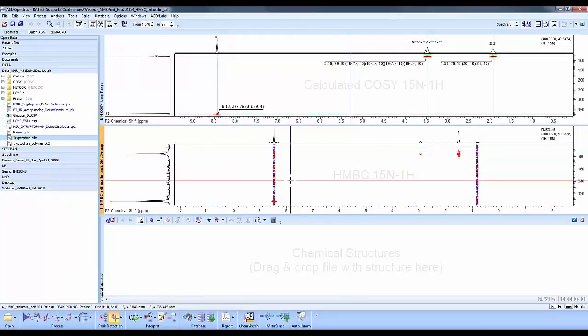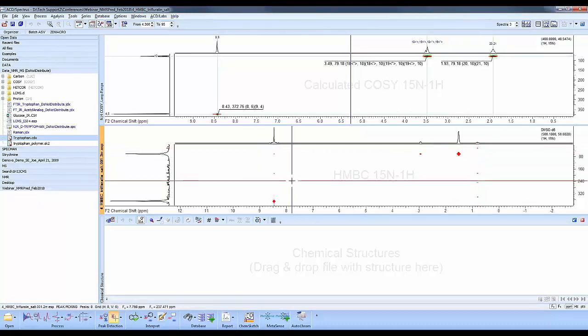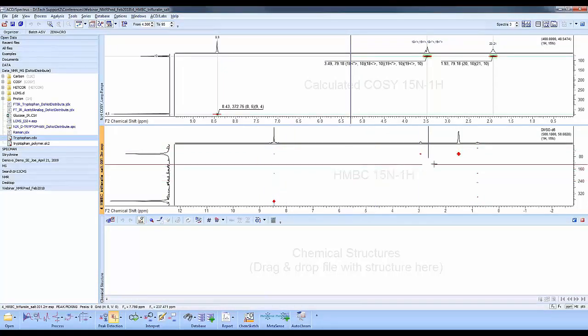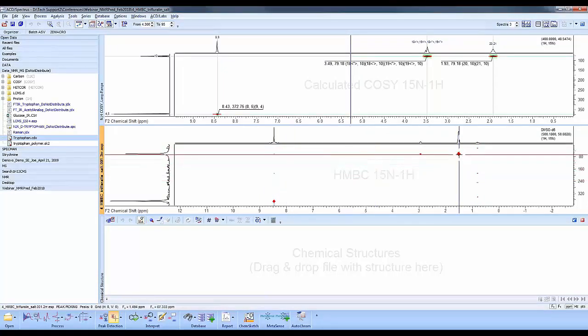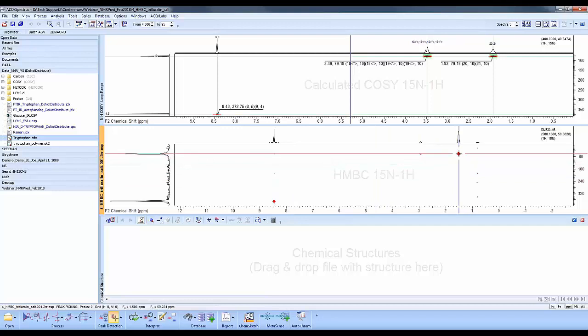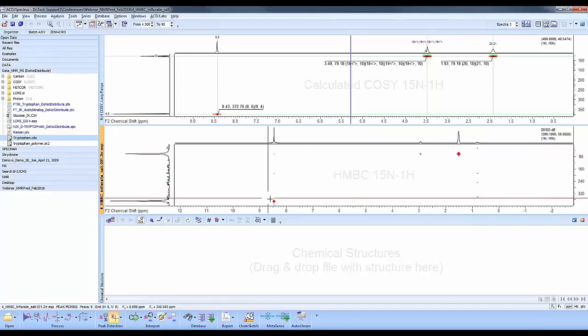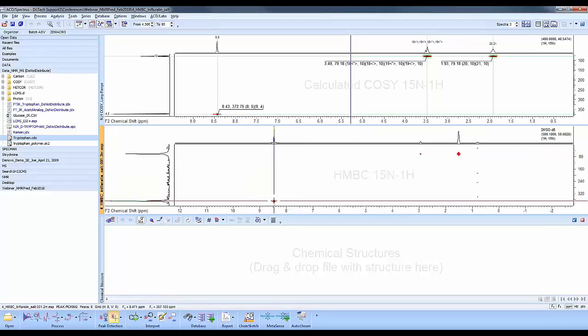The bottom now is the experimental. I'm just going to adjust the wheel so you could get less T1 noise there. You can see here this one is around 70-60 ppm, the NH plus salt, and this one, if I mouse over it, is around 370 ppm.